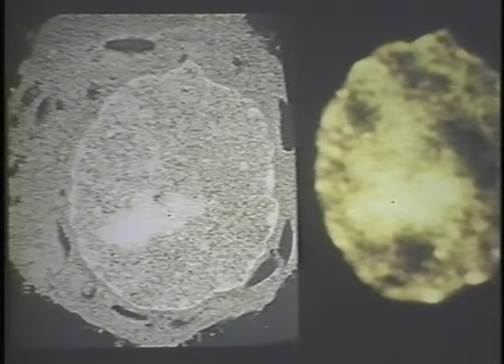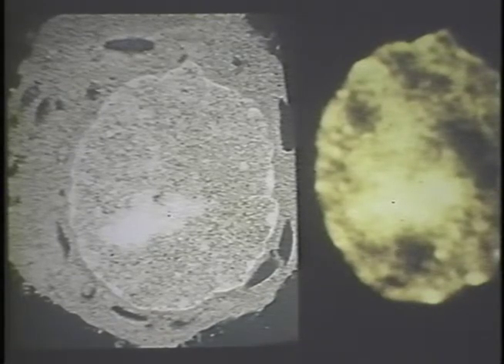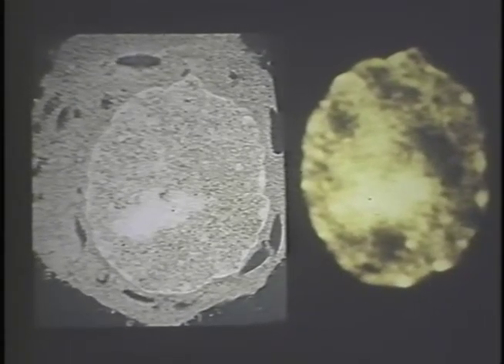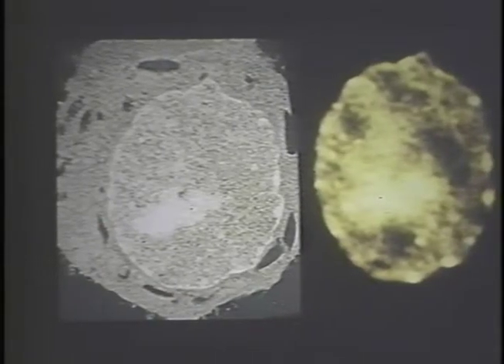One of the things that our ability to do light microscopy helped us with quite a bit was to do simultaneous staining for both electron microscope and light microscope of the same sections. Shown here is a typical image of an interphase mammalian cell. Here's the nucleus. What one sees is a typical granular appearance in the nucleus, with heterochromatin clustered around the outside, but a rather uniform appearance throughout the nucleoplasm.